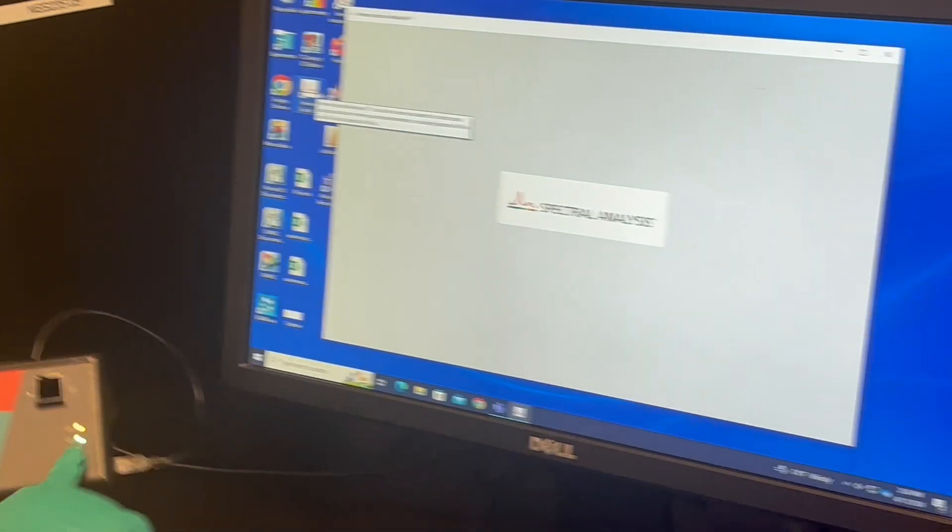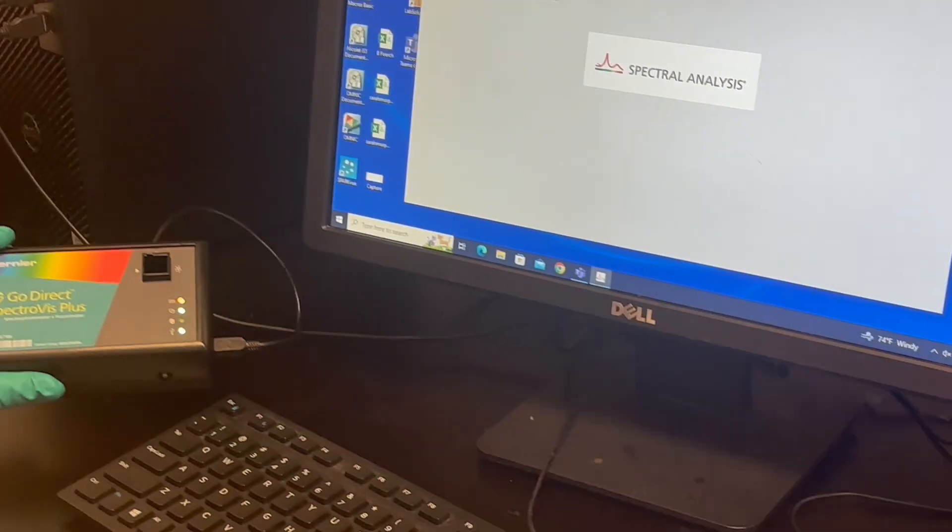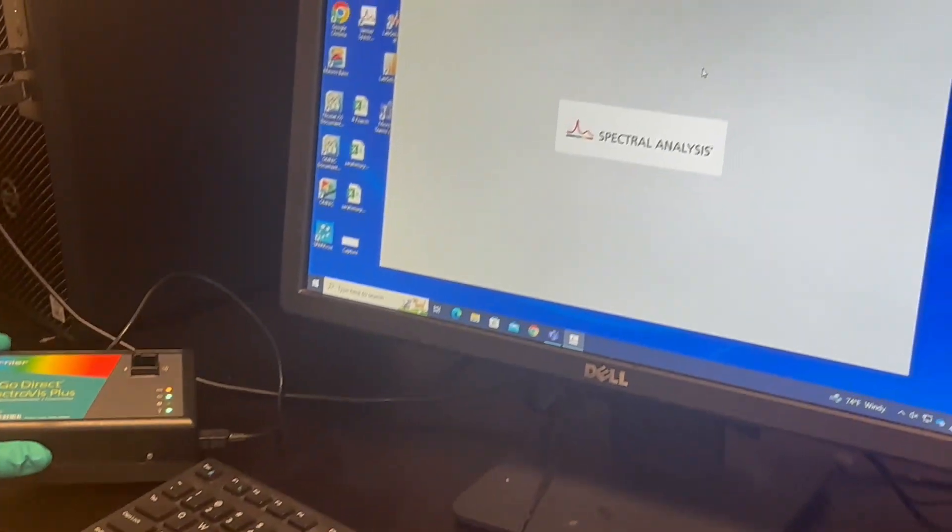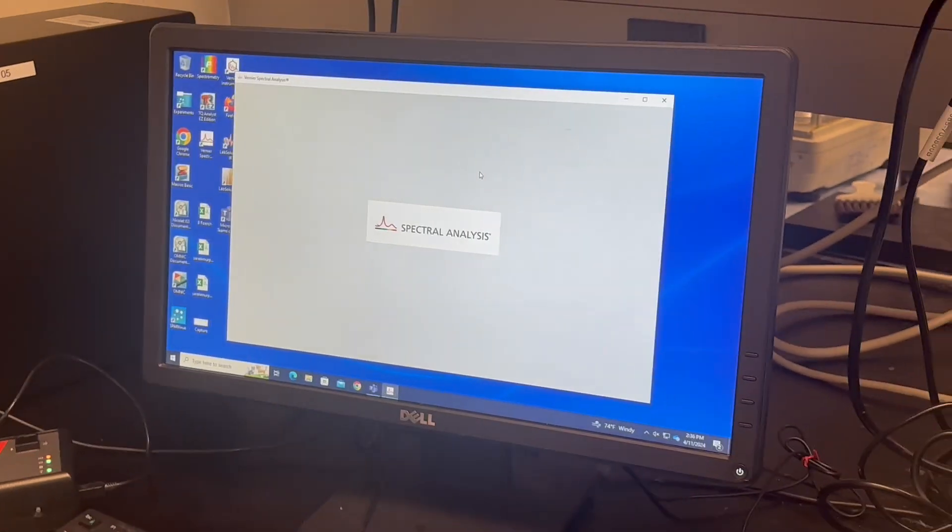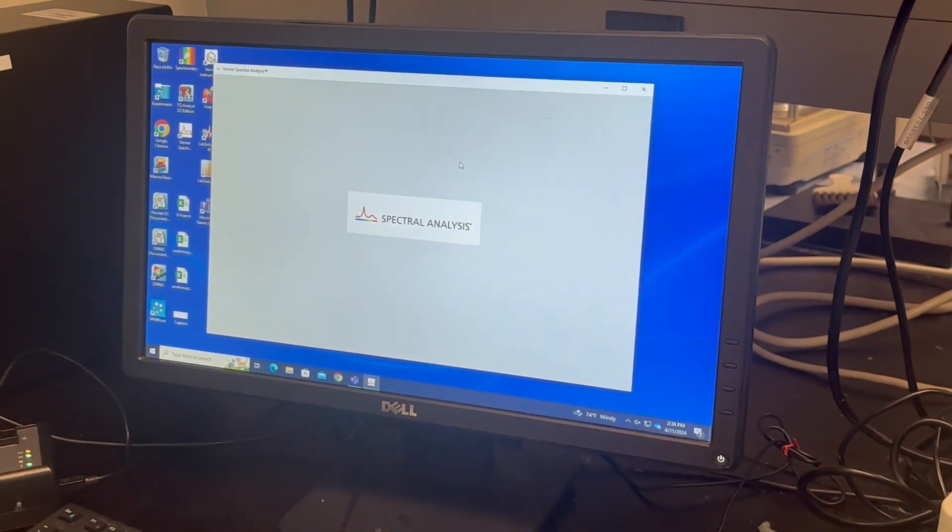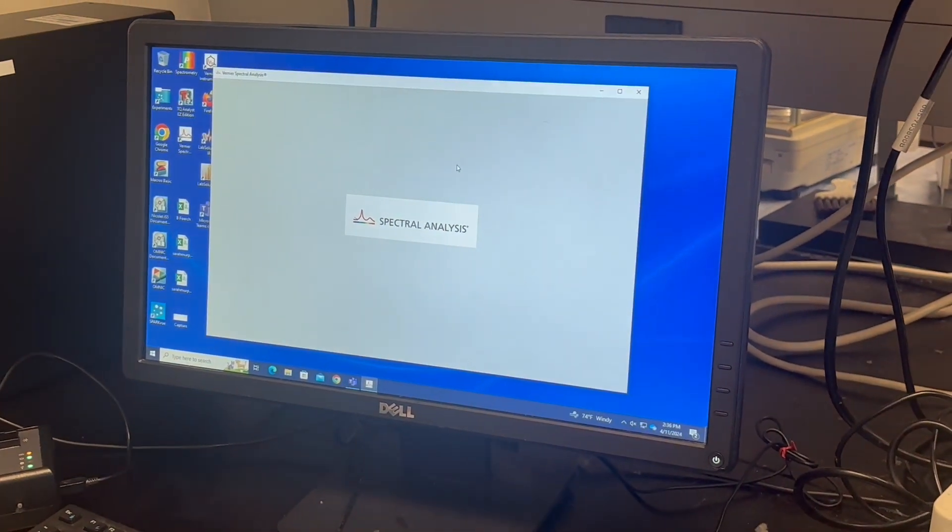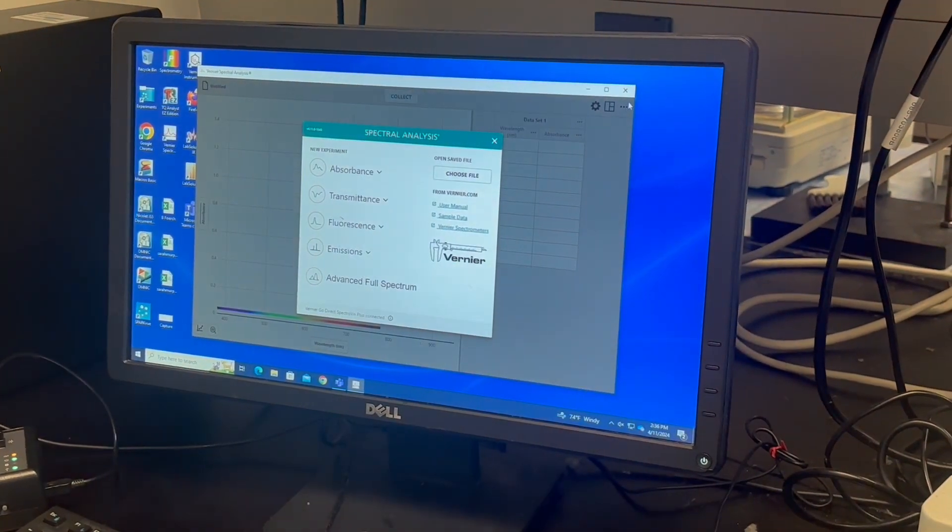So you open the Vernier software. You make sure all of these lights are on. And then we let it connect. It takes a minute sometimes.